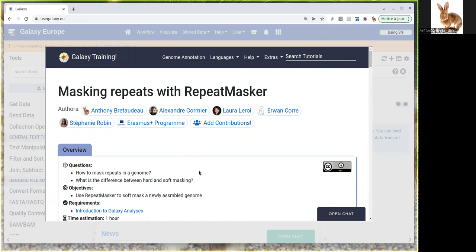Some software perform de novo annotation of repeated elements by comparing different sections of the genome sequence to find all the subsequences that are repeated. Other software like RepeatMasker use databases of known repeated elements already found in other genomes.